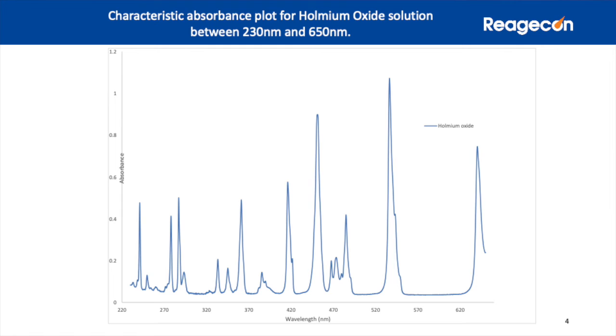Wavelength standards are chemical mixes known to give a spectral scan containing a series of characteristic peaks correlating with the wavelengths of the measuring instrument. For example, when holmium oxide is diluted in perchloric acid, it provides a set of known responses or peaks at different specified wavelengths. In addition to the use of holmium oxide, the elements didymium and samarium may also be used as wavelength standards, as can be seen.